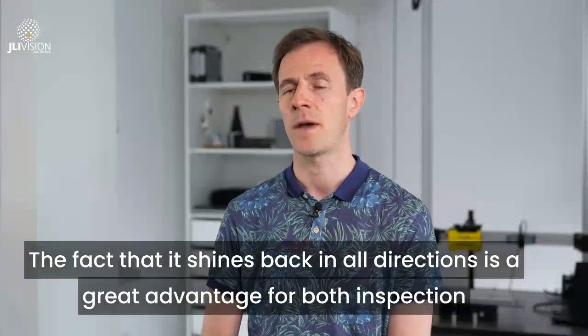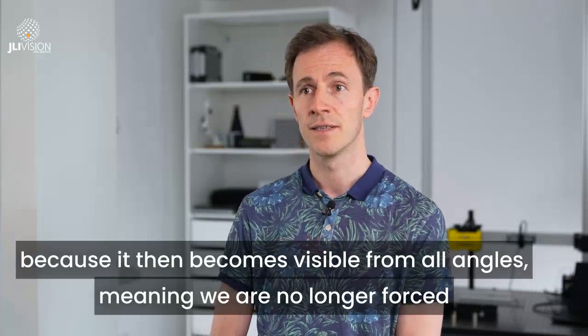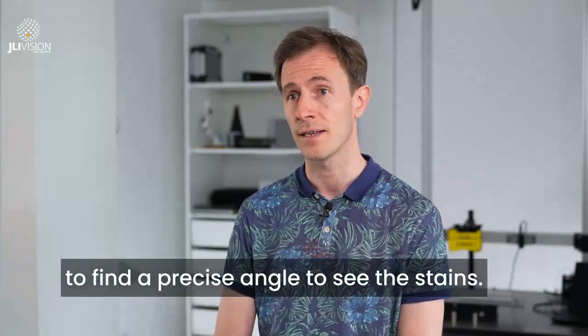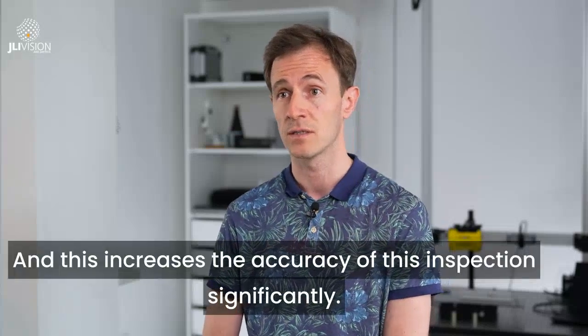The fact that it shines back in all directions is a great advantage for inspection because it then becomes visible from all angles, meaning we are no longer forced to find a precise angle to see the stains. And this increases the accuracy of the inspection significantly.